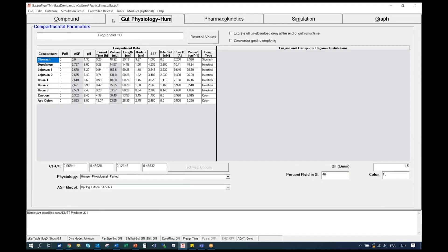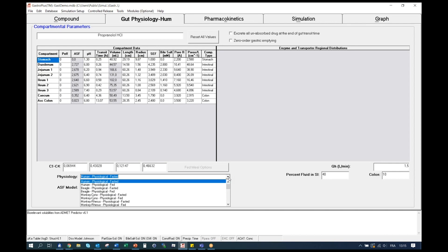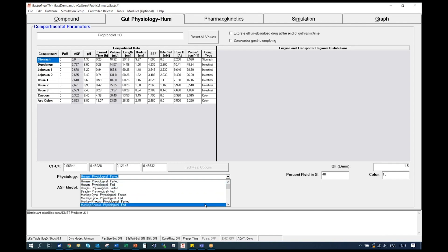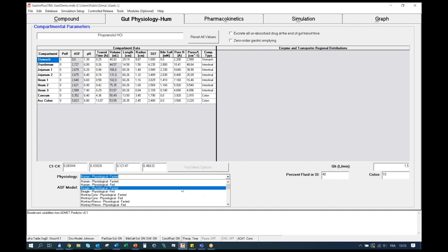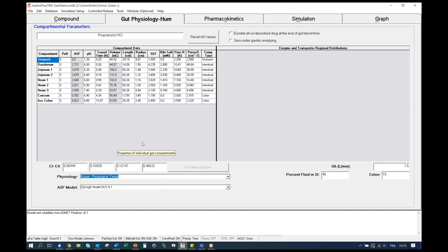The second tab, Gut Physiology, is where you will define the gut physiologies for your simulation. Multiple default physiology options are proposed in the software for either human or preclinical species in different states, whether they are fasted or fed. The user can also create numerous different physiologies and save them in their own database. To access these physiologies, simply click here on the menu and you can select different physiologies, whether you're doing a study in human, beagle, monkey, or other preclinical species. Let's stick to human fasted, as it was the physiology of the subject used for propranolol in this clinical trial.